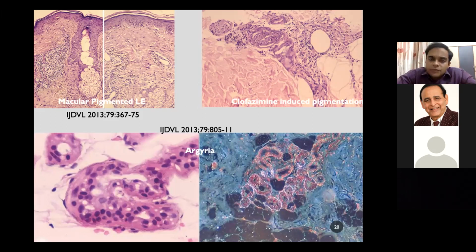So what we come across is multibacillary leprosy, or atypical presentations of leprosy, or ulcerated forms of leprosy, or just pigmentation. This was one case which was actually detected just on skin biopsy. The patient had sensory loss, and there was no other finding, no skin lesion, and we just happened to do a skin biopsy. Historically also, I don't know what was found. The patient was not very confident about any previous treatment history.